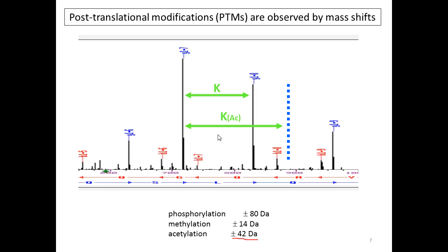But still, computing power such as it is, we generally are parsimonious with our exploration of post-translational modifications because it does increase the computation time exponentially, and also it works as a bit of a fudge factor because what we're saying is, well, there are more ways to match the proteins, the peptides, to the spectra, right? You could say lysines can be this heavy or this heavy, and so you're just adding more variables, and of course, if you're not careful, you will get more matches because you have more chances of matching.